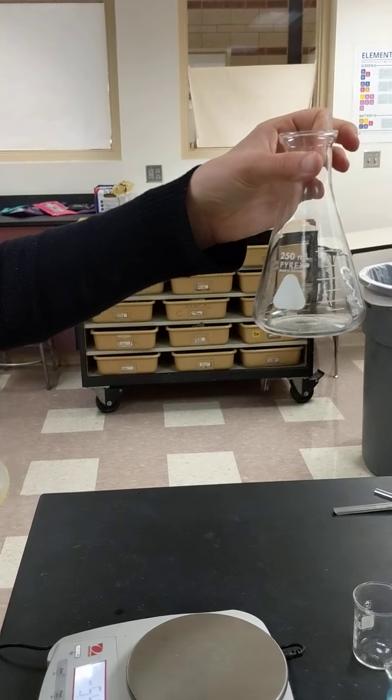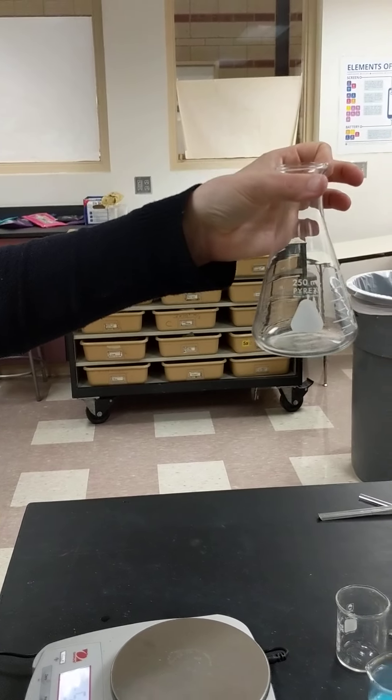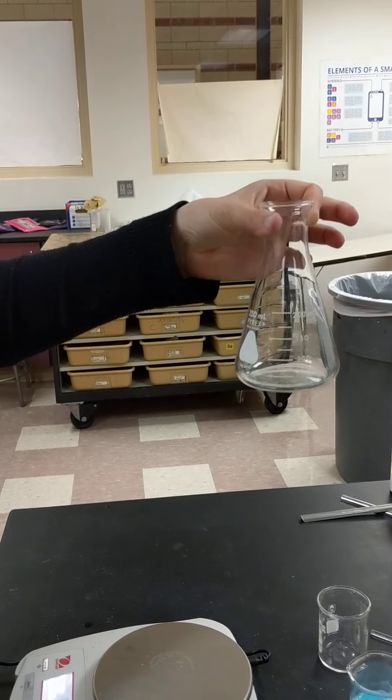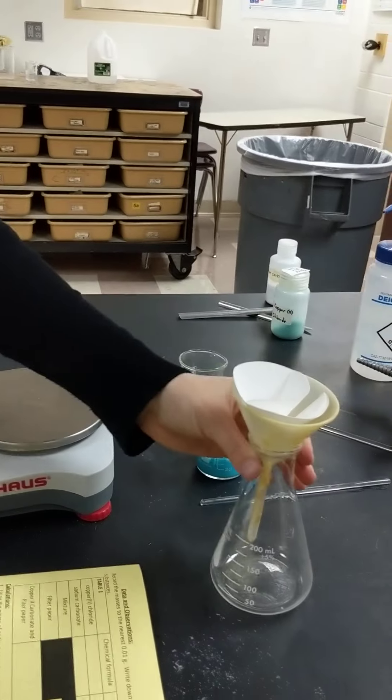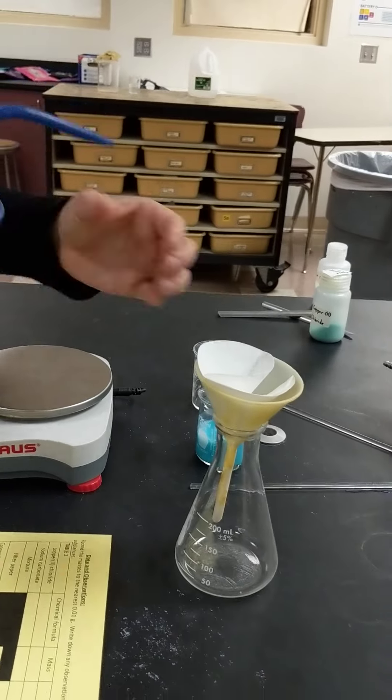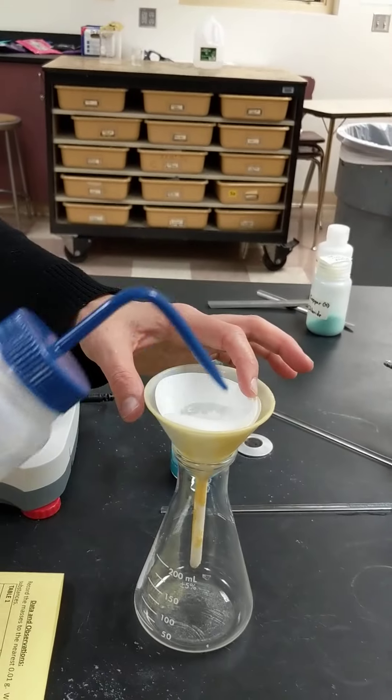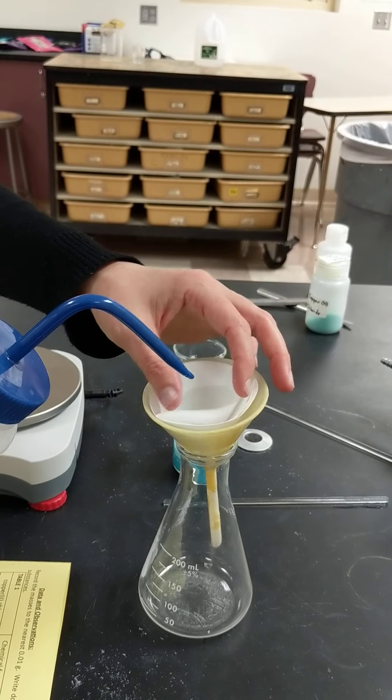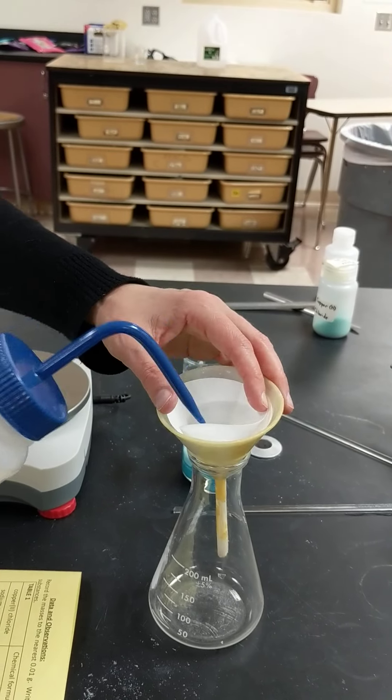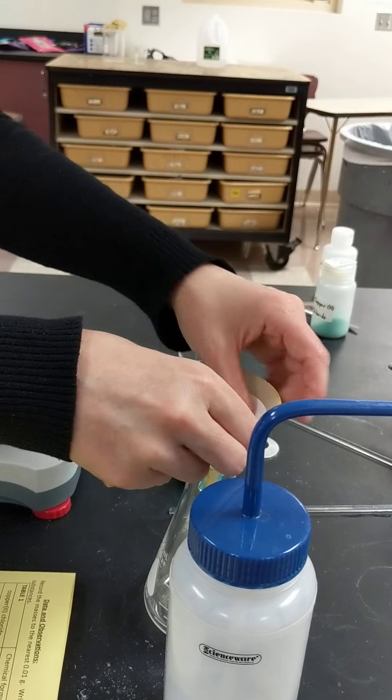And it's going to go into an Erlenmeyer flask, which we call an E flask, like so. A good chemist will always put a little bit of water in there to kind of hold it down to the sides.